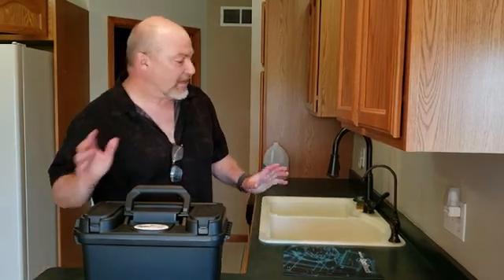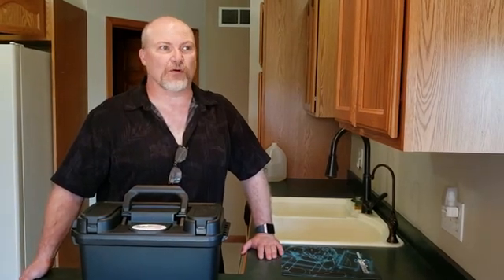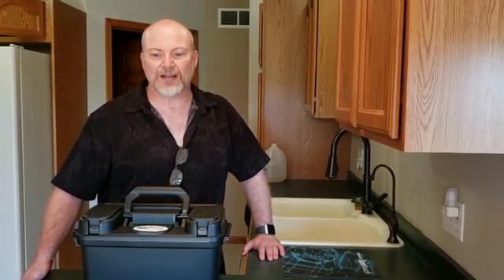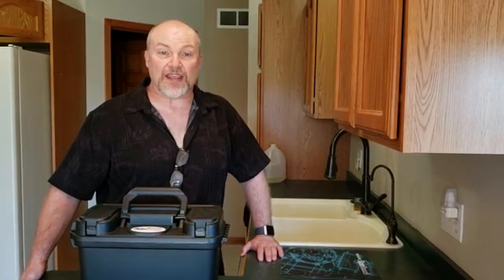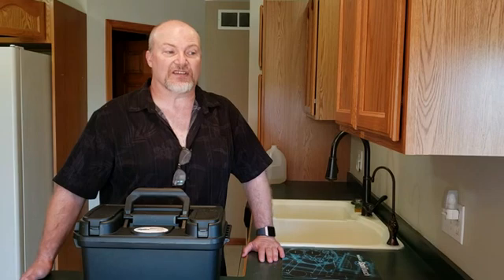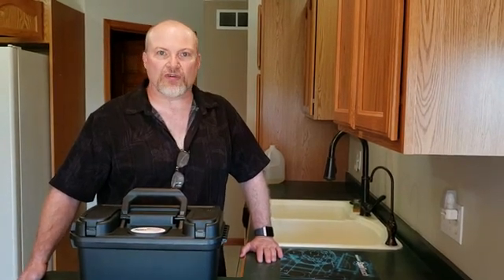I'm going to test the water today at a home I've tested dozens of times — this is the home I've lived in for 16 years. In general, over the past 16 years when I've tested the well water here, I've had between 21 and 23 grains of hardness.